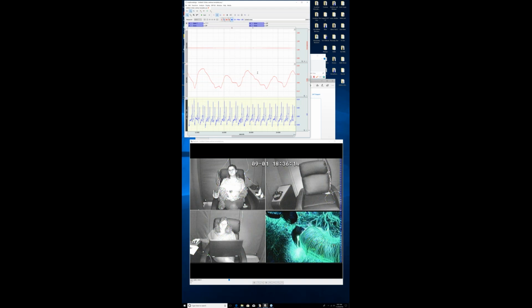All right, so Neek has a question. When using video in combination with physio data and for like E-Prime, can you do the delta T sync with each channel individually or only once? Hang on, let me unmute you again. There you go.